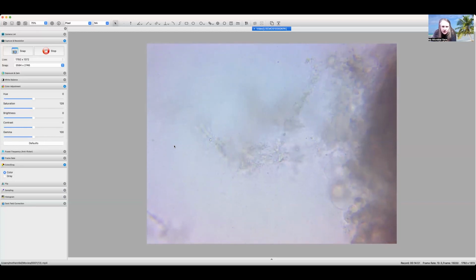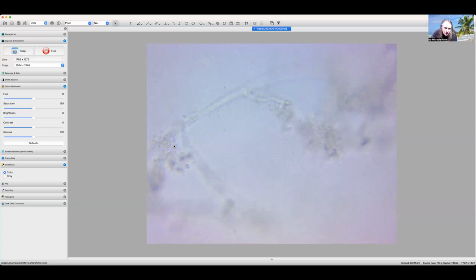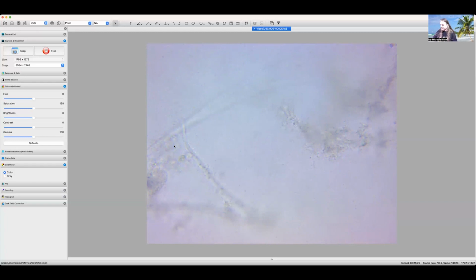But here is where I can clearly show you some septa, I think, if I would have recorded the last time. So fungal hyphae coming out of here. But the septa aren't really, yeah. I think I see, if I'm focusing, pay attention where that septa, 1, 2, 3. Am I correct? 4 on that septa. 5. Going right down through there.